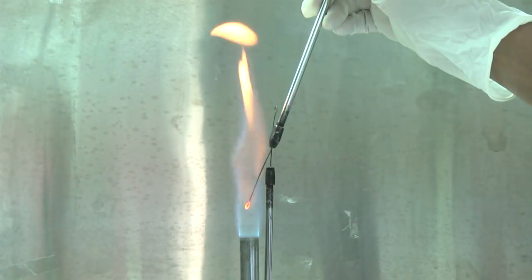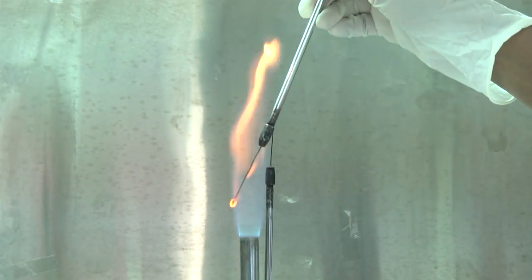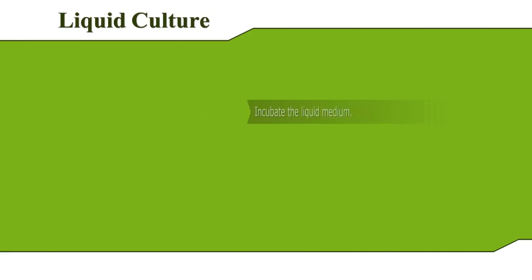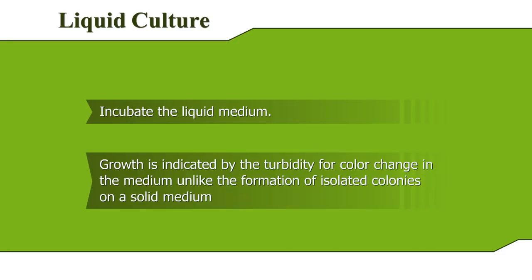Sterilize the wire loop before keeping it down. Incubate the liquid medium. Growth is indicated by the turbidity of the medium, unlike the formation of isolated colonies on a solid medium.